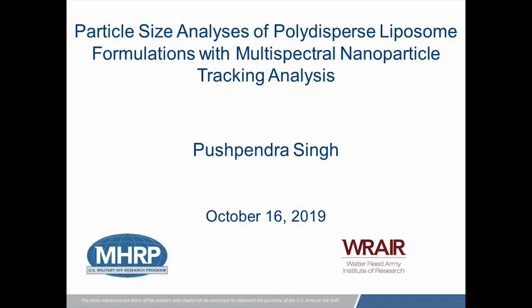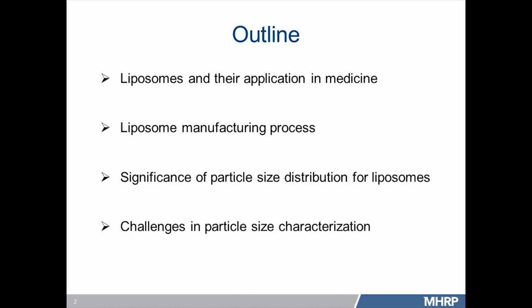Today, as Julie mentioned, I'll be talking about this new novel biophysical technique of multispectral nanoparticle tracking analysis, how we applied it to our polydisperse liposome formulations that we made in the lab. I have divided the whole talk in four subsections: liposome and their applications in the medicine, the liposome manufacturing process, which will entail how these particle size heterogeneities originate in the liposome samples.